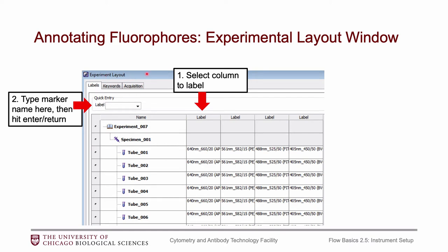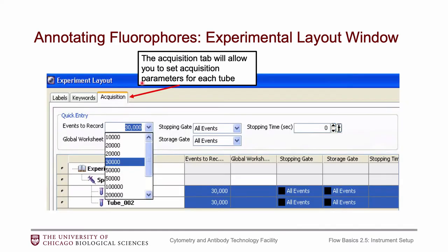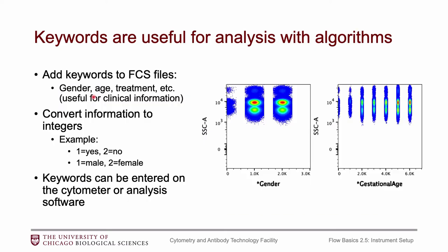The experiment layout also has additional options. There's an acquisition tab where you can adjust events to record, stopping gate, and stopping time per tube — you can also do this while running samples if you prefer. There's also a keywords tab. I don't personally use keywords in the software, but I want to point out that they are an option and are most useful if you're going to do analysis with an algorithm like t-SNE. You can also use keywords to include additional information about your experiment.